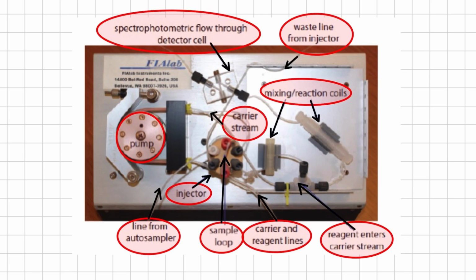Incorporating a separation module in the flow injection manifold, we can include a separation.